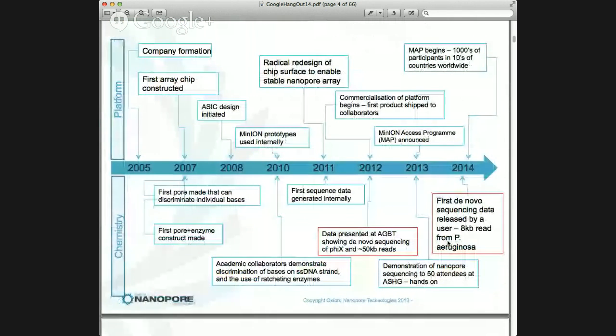Now, there is on the website just a history of nanopore. I'm sure most people aren't interested. But in essence, we got our proof of concept data in late 2011 on DNA sequencing with STRAND. For various reasons, we announced that in 2012, and we announced our intention to launch products, and we described what those are. And then it's in 2014 that we've actually begun our early access program in earnest.